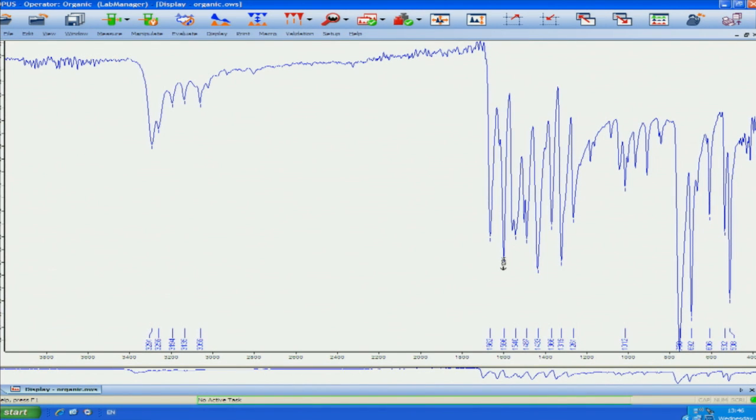The quality of the spectrum is indicated by the clarity and intensity of the bands. Common functional groups have designated frequency and intensity. Refer to your lab manual for a more comprehensive list. It is important to note that the strengths of the peaks are relative to one another. A strong intensity does not necessarily mean it will reach the bottom of the spectrum, but rather it is strong in comparison to other peaks.